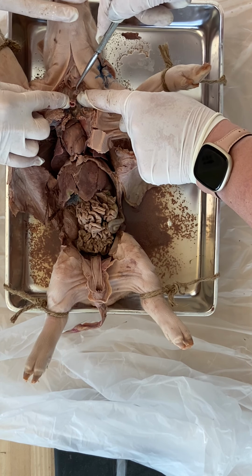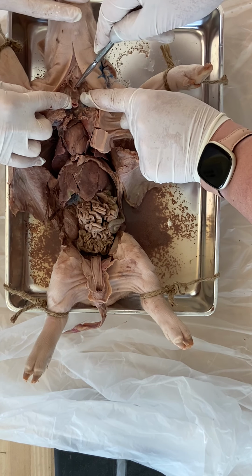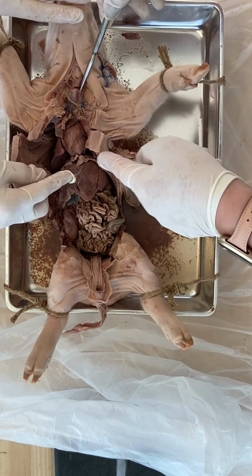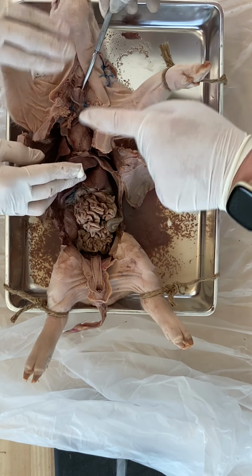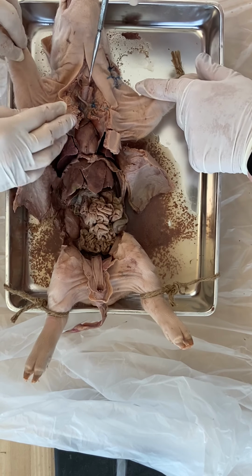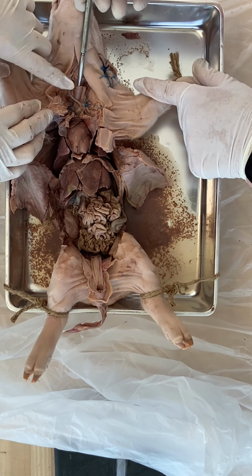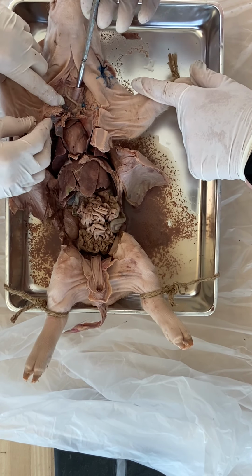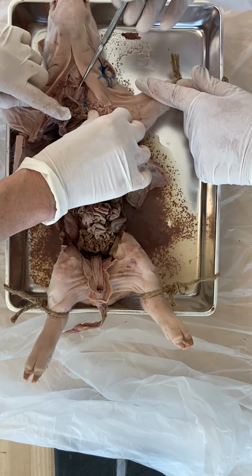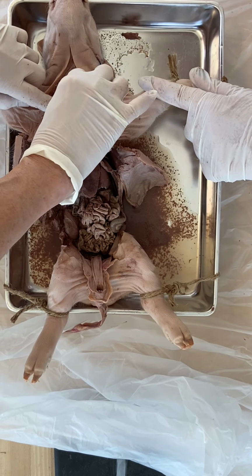So that muscular tube. Now, if we carried on, of course, with the tool down here, this would lead us all the way down into the stomach. This is the one that goes through the diaphragm. And if we went down this one, we are going into the lungs. And this is just a large blood vessel, yes. I'm pretty sure those are just blood vessels. They look like blood vessels.